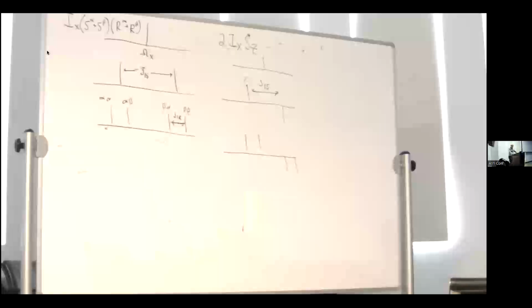I mean, NMR pulse sequences. So we want to know what happens in the evolution through these four different sequences, so that when you're looking at a complicated pulse sequence, if you can reduce it to blocks where you already know the answer, your life is a whole lot simpler.